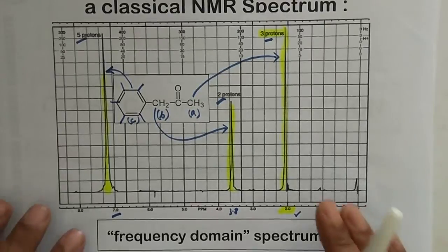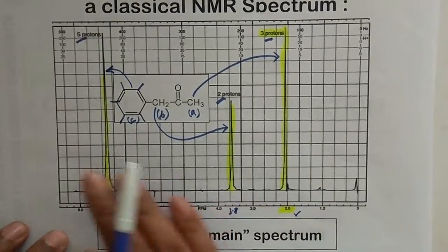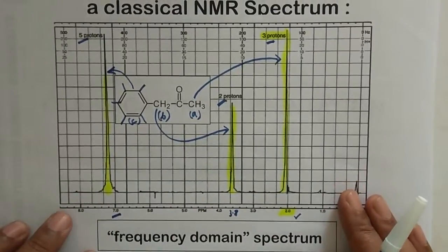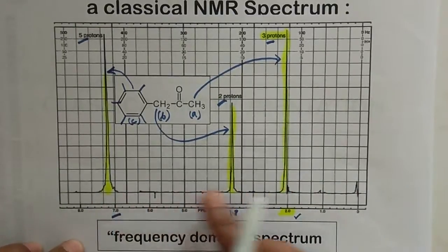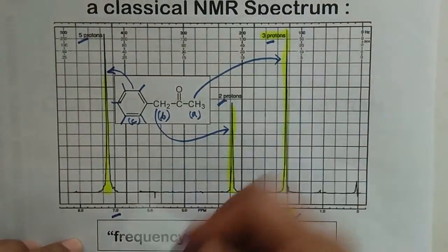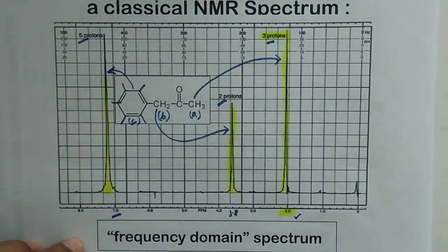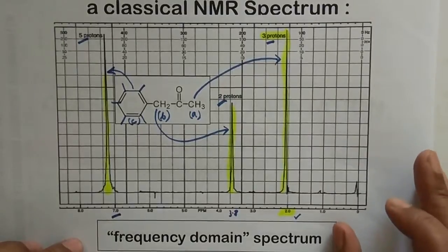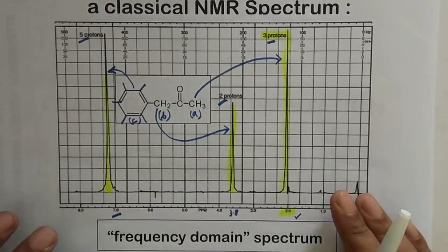But nowadays, if you do NMR spectroscopy for your molecule, you will not have this graph-type problem, right? Now they will give a simple plain paper, and on that plain paper you will have your peaks, with integration signs, and after the integration the number of protons would be written there. Later in some other class I will show you the original spectrum which we generally get after NMR spectroscopy. I will show a spectrum which is actually my own, from one of my published research papers. So I hope this is clear to you.